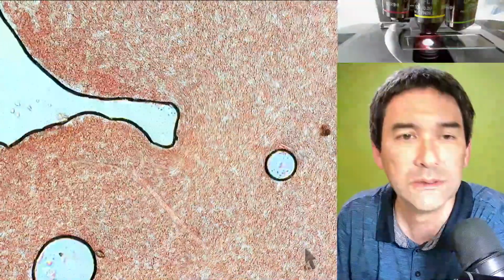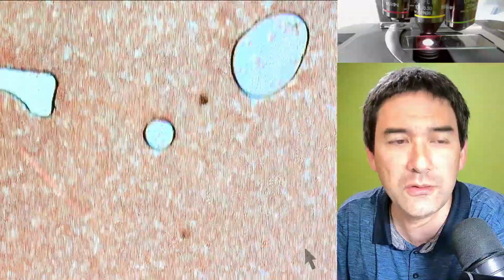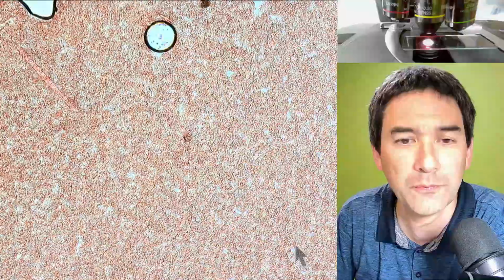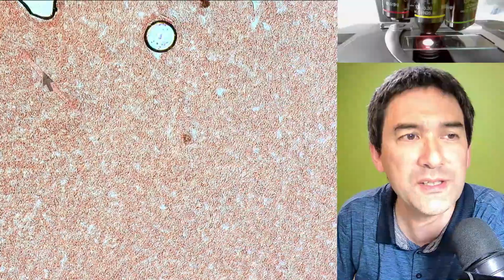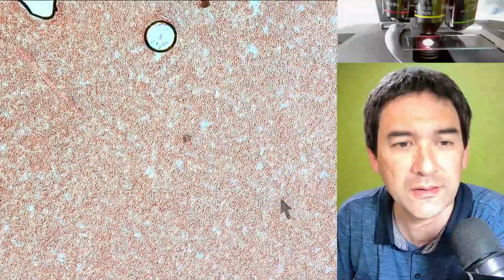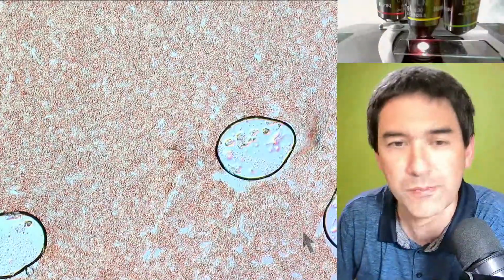And that's actually one of the nice things, because yeah, there is, look, we just ignore that. Some people say, "Oh my gosh, what is this here? These long things here." Well, this is just dirt on the microscope slide. So there's nothing to worry about. Those large things here are, of course, bubbles.